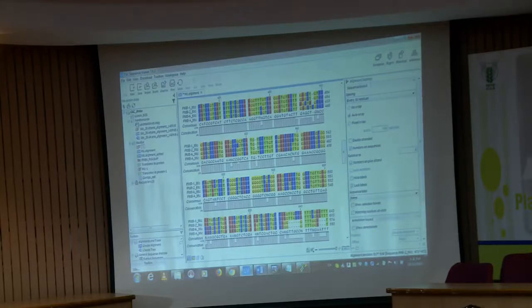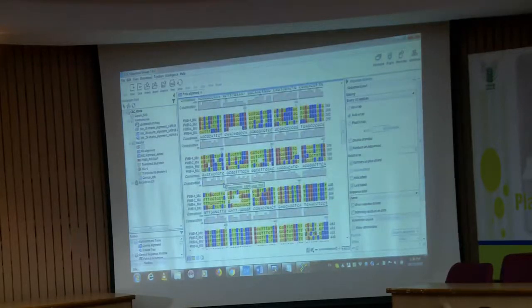So, this is one step of editing. Another step is while we were doing the multiple alignment. Although here too many dissimilar things are there, otherwise in the beginning it generally does not match, at the end it generally does not match, because one sequence will start at one point, but maybe another sequence will start 10 bases downstream to that, right, but we want to make it uniform. So, that step is called the trimming of the 5' and the 3' end.